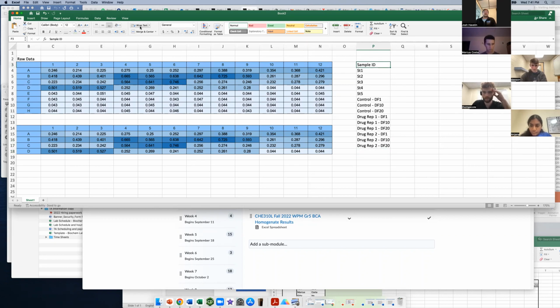Okay. Any questions about that? That's pretty straightforward, right? Oops. Does anyone know what I'm missing? It would just be the blank. Yep. And that wasn't like a trick. I just forgot to type it in. Blank.